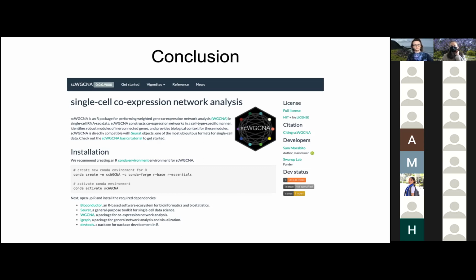Okay, cool. It seems it's faster than the regular WGCNA, right? I don't think it is, because it's using the same functions. The actual function to construct the network is the same. Well, I always parallelize, and if you parallelize it, it's way faster. I use 32 cores, and then it's pretty fast. Can you parallelize on CPUs, or is it just GPUs? Because it's network stuff, it's CPUs. This is not GPUs. I think it's the built-in function in WGCNA that you can use to parallelize all your functions. Yep. Okay, cool.